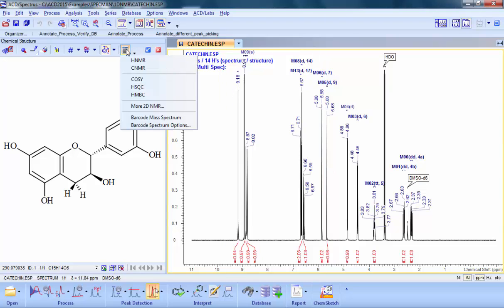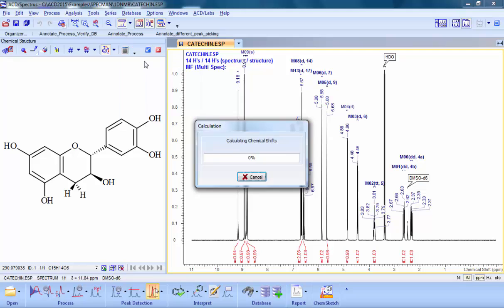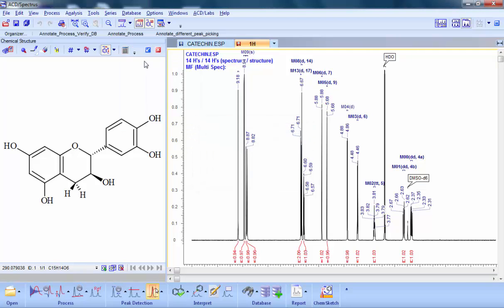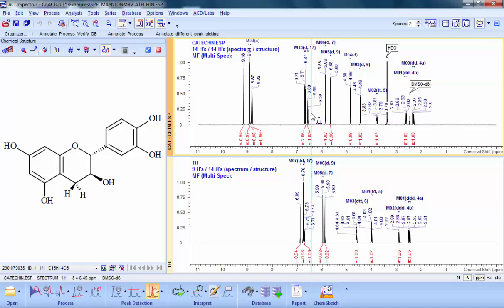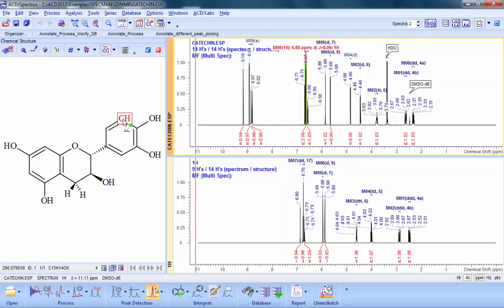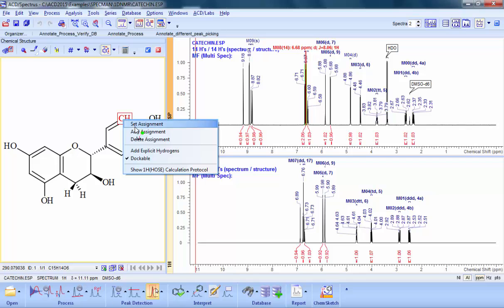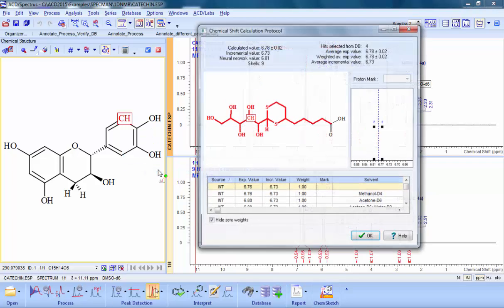With NMR Predictors, a complete predicted spectrum can be calculated and displayed alongside your experimental data for more thorough structure verification. As before, the complete calculation protocol is available for each atom.